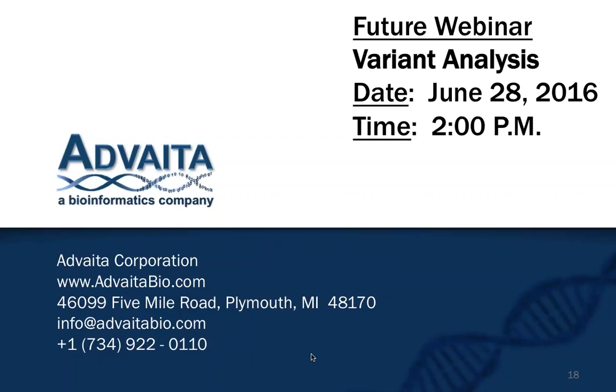Each data set has its case versus control. The mRNA data has been analyzed and metrics have been generated for that. So I guess that'll probably explain it well: for each of the single contrasts, let's say mRNA data, case versus control, the metrics are generated. For protein data, case versus control, metrics are generated. In the meta-analysis then, these are combined.